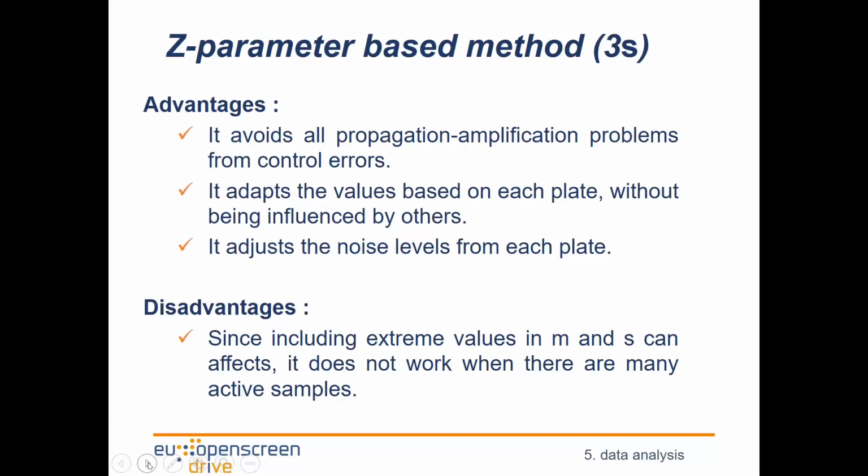But the limitation is that sometimes when we evaluate the plate, we evaluate all of the samples that are in the plate, and then we evaluate the strength of the plate.